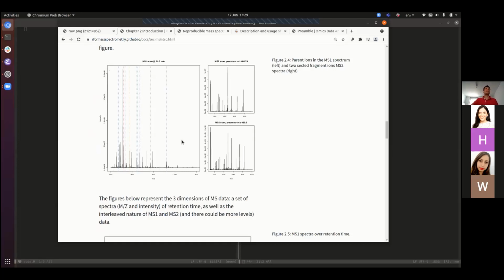And so if you want, this is the unit of data that is acquired in a mass spectrometer. These are scans. And these are two-dimensional objects. These are matrices that have hundreds of rows, and they have two columns. One column represents the m over z value of that particular ion and the other the intensity at which it was measured. Any questions so far?